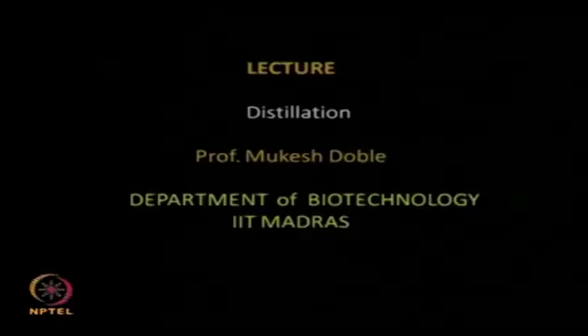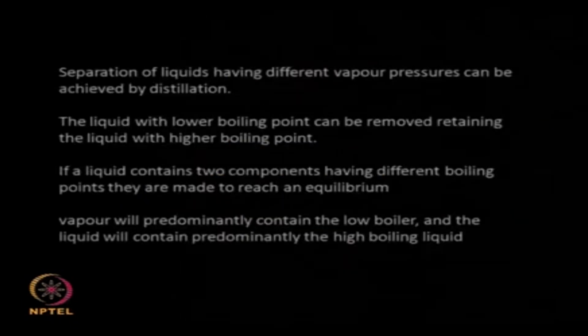So distillation has many advantages, especially for recovery of solvents from chromatography, recovery of solvents from extraction, and so on. It is good if you want to separate liquids having different vapor pressure. So the principle of operation is based on vapor pressure.